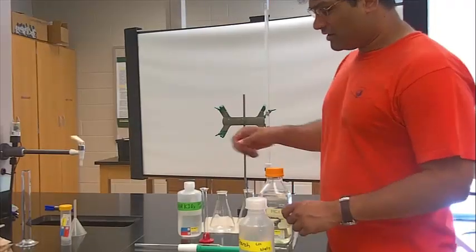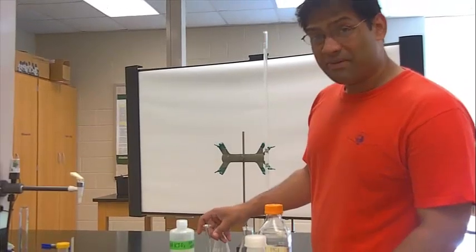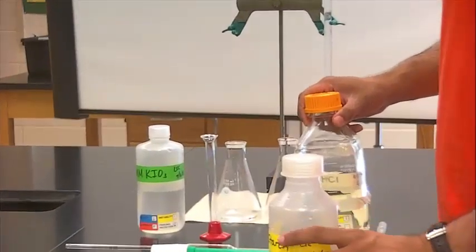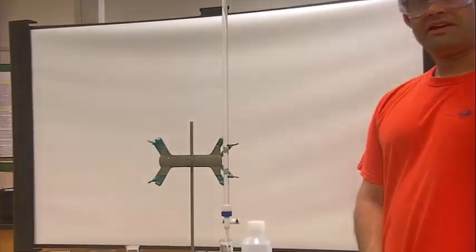So what I'm going to do now is pipette my 10 mL of potassium iodate, put in some of my pellets, and put in about 20 drops of the HCl according to the protocol, and then I'll begin my titration. All right, now we're ready to perform our titration.